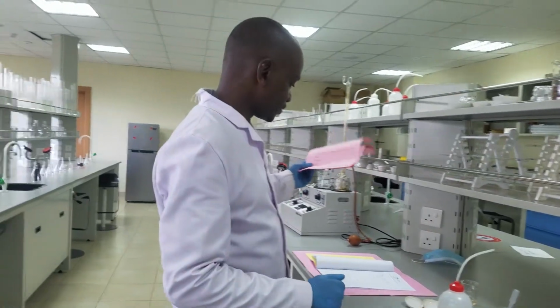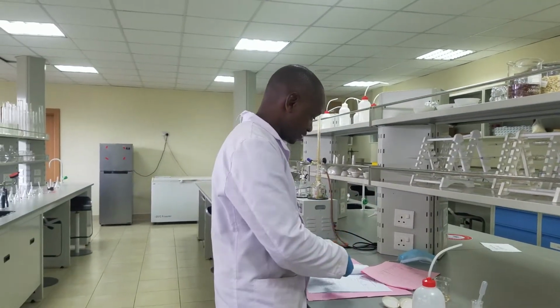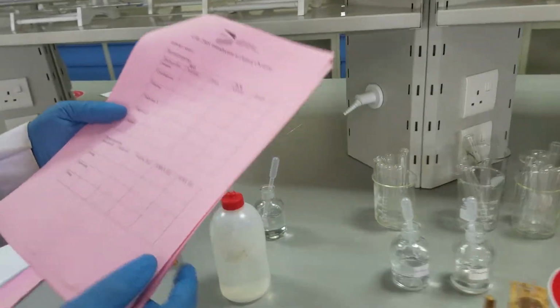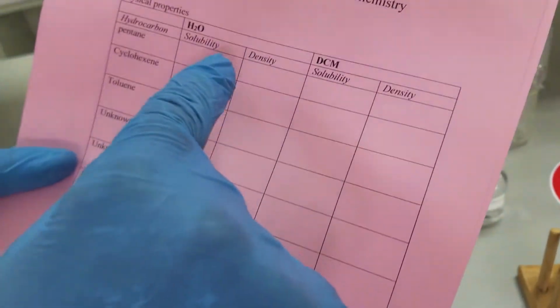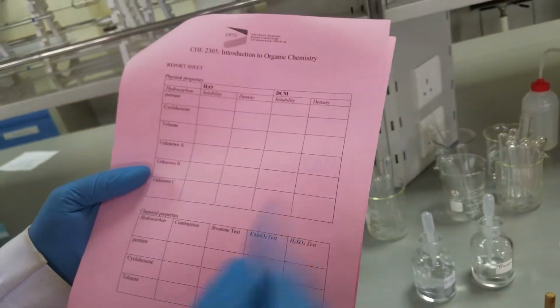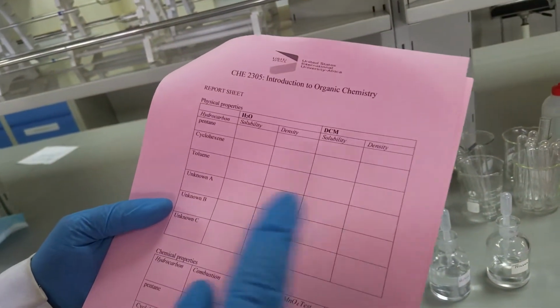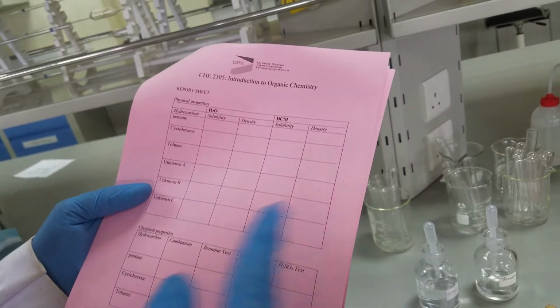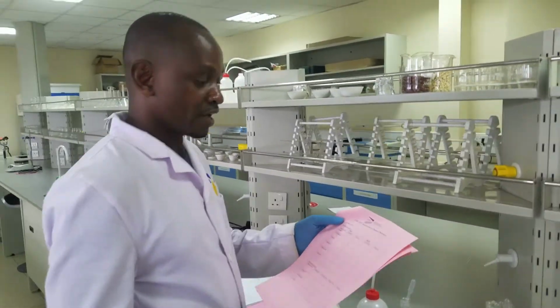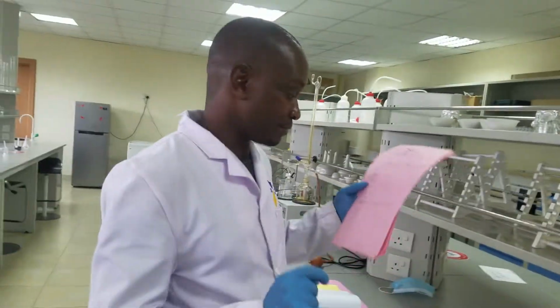Okay, so you are going to write your inference in the table, what you have seen. I would also want to emphasize density. As you do so, remember to tell us whether it is denser than or less dense than water. The next thing I want us to do is for DCM now.